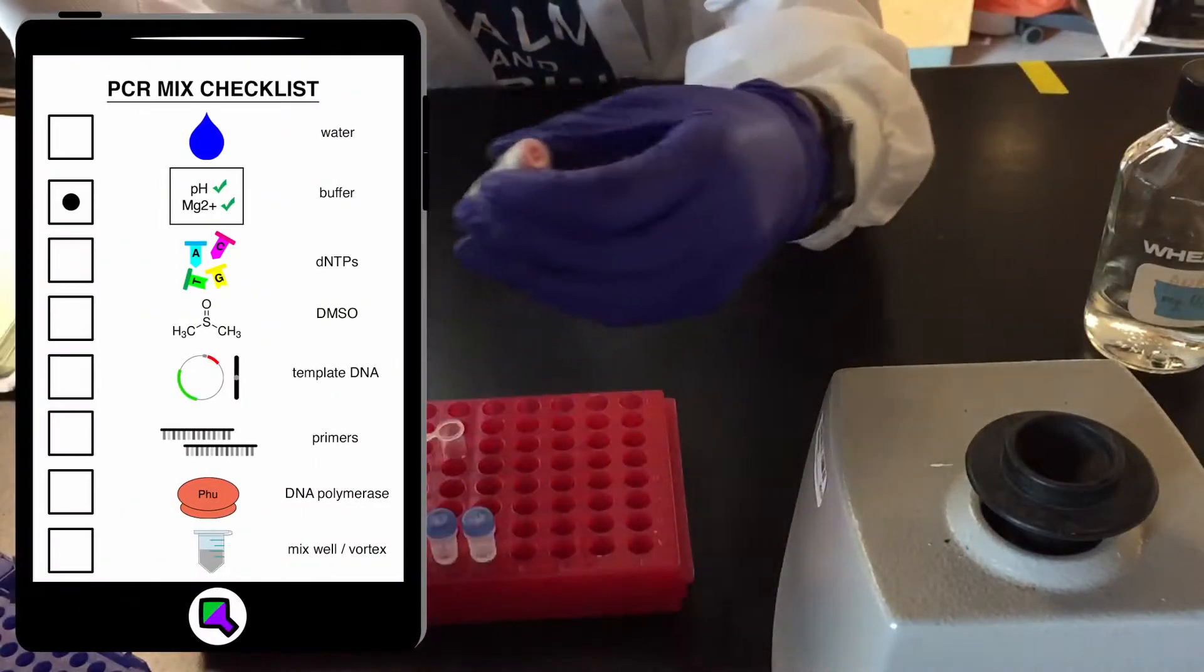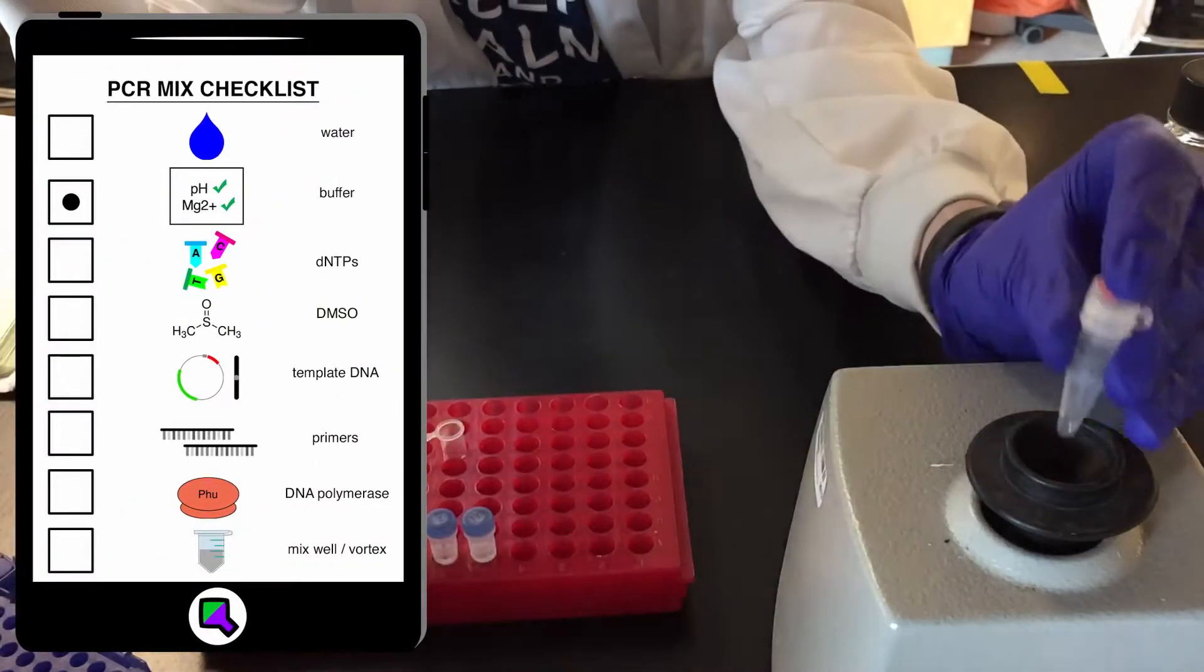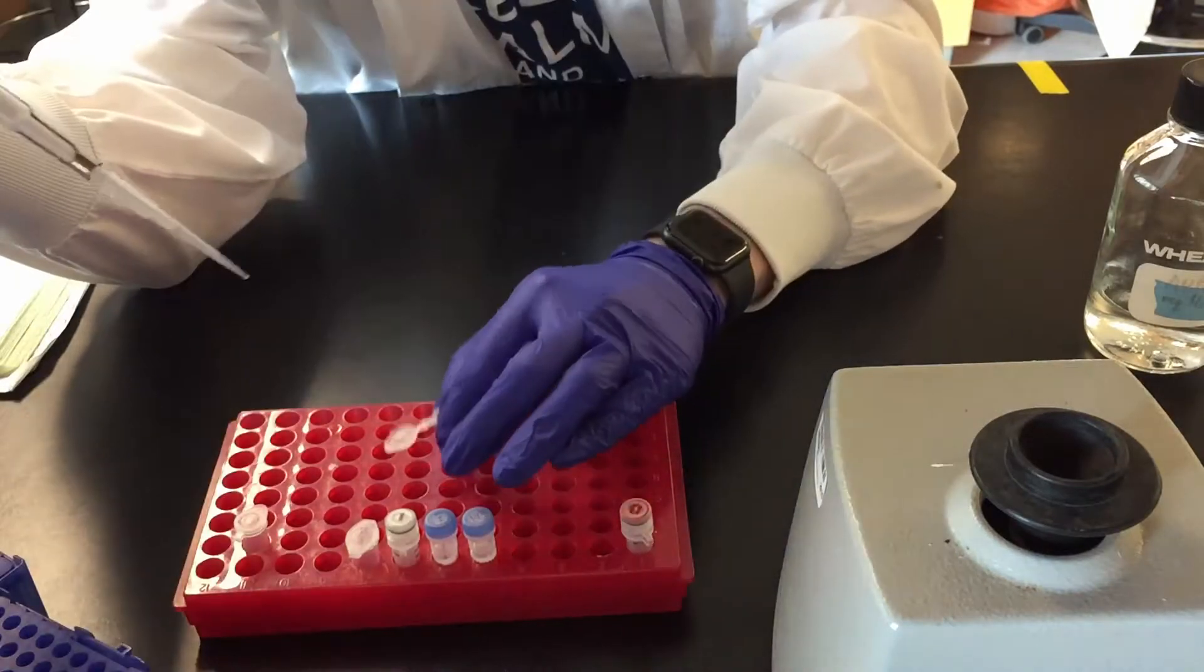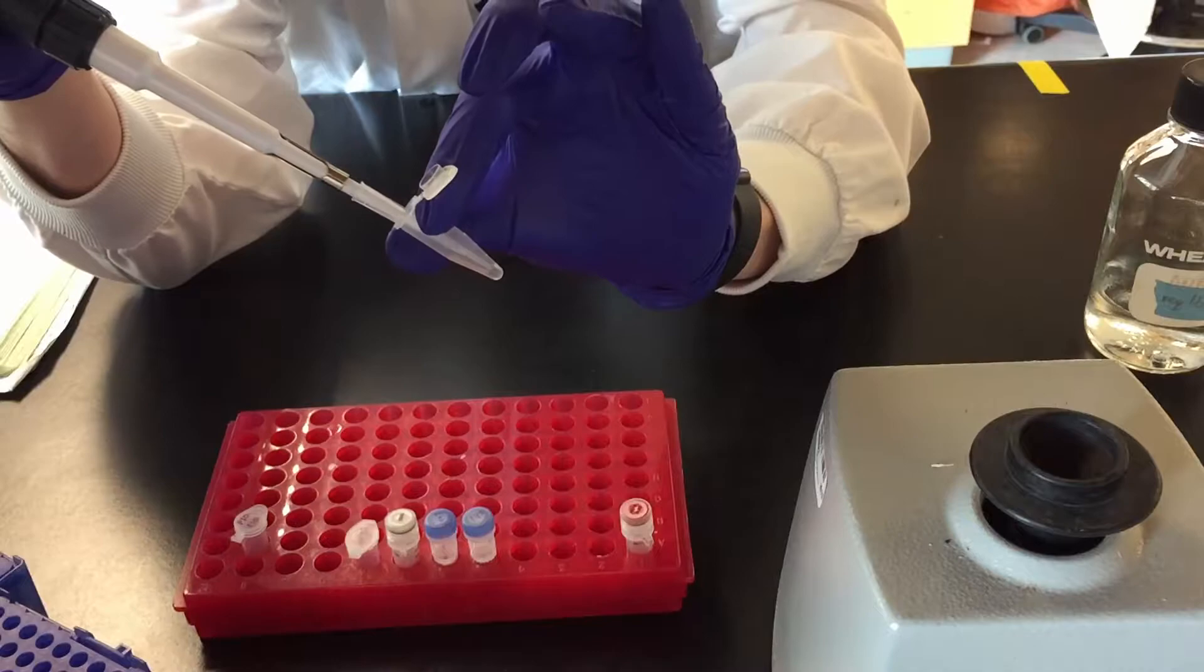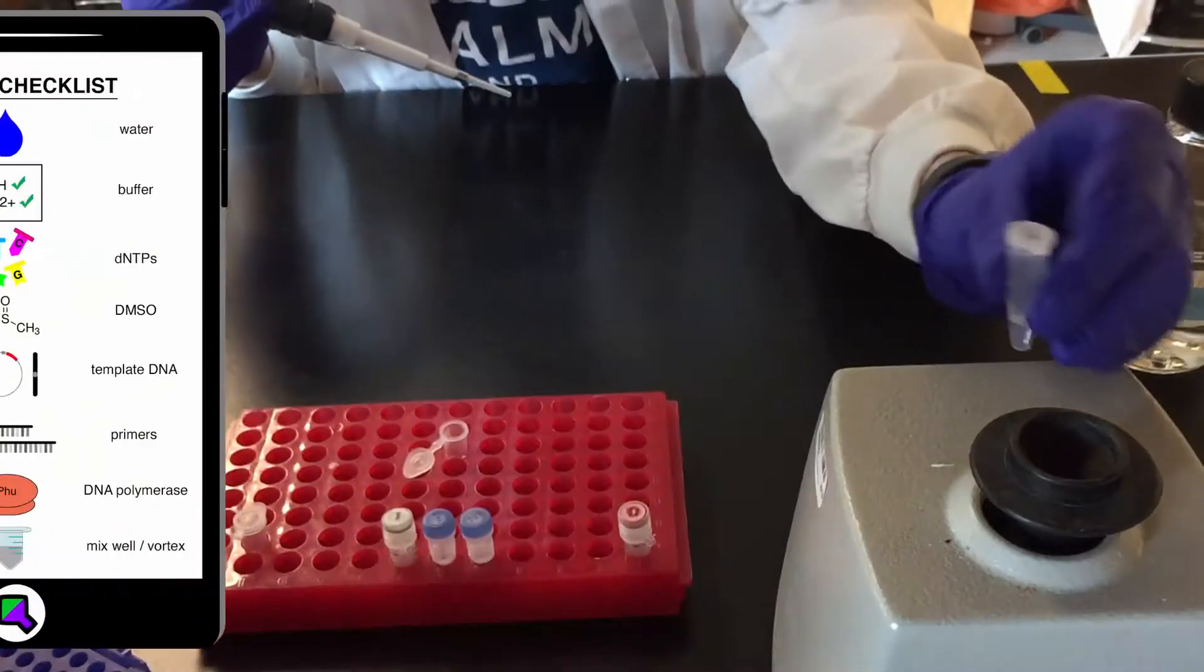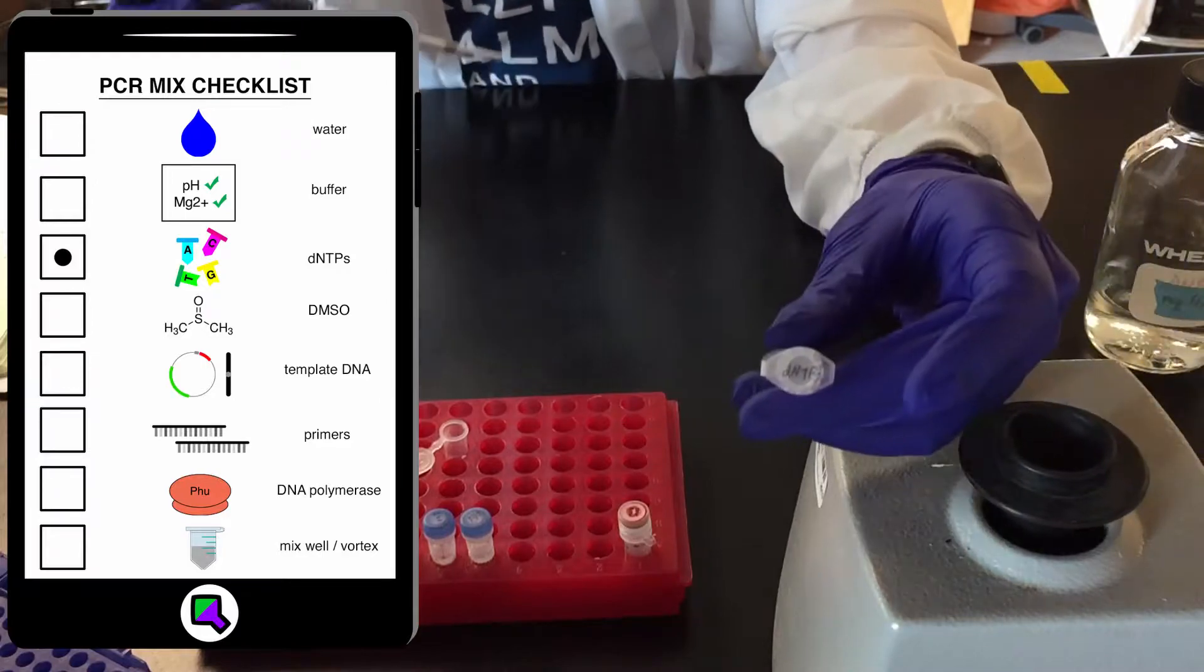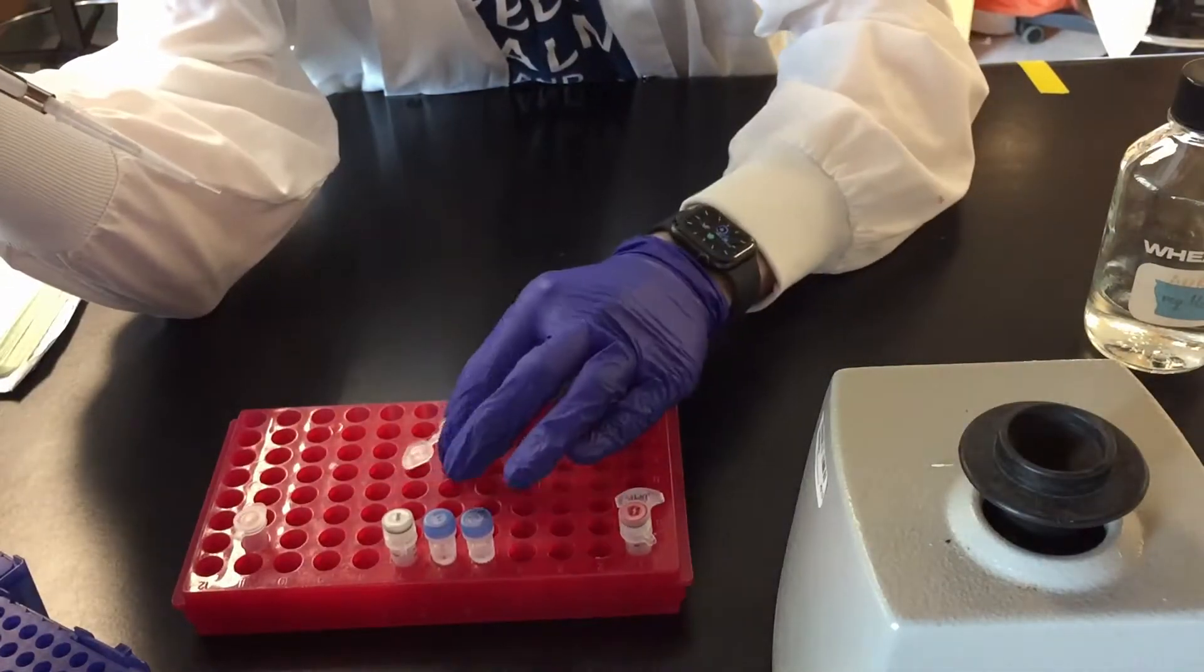Next we add the buffer which controls for pH and usually provides magnesium which is a cofactor for polymerase. DNTPs are pre-mixed building blocks of DNA: adenine, cytosine, thymine, and guanine.